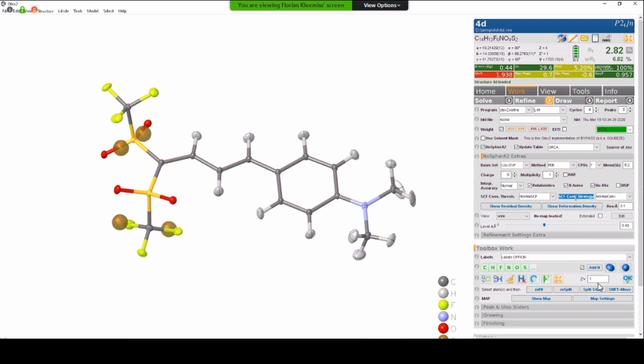So in wave function calculation, there's various ways to make the wave function converge. And if you select here normal conv, this is the default setting that would be there if there is no further mention of anything in the input, but you can, for example, choose easy conv. If you know that the wave function calculation is very robust, this will save you at least 1 or 2 cycles, which might be useful if you use a very sophisticated method.